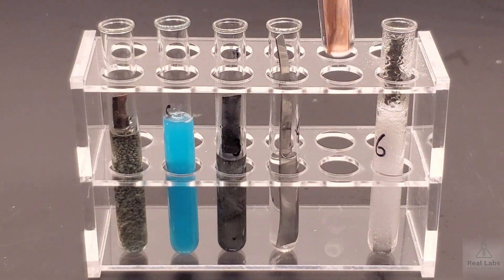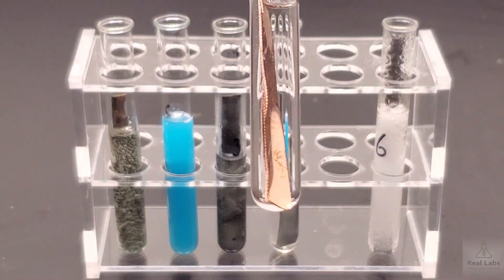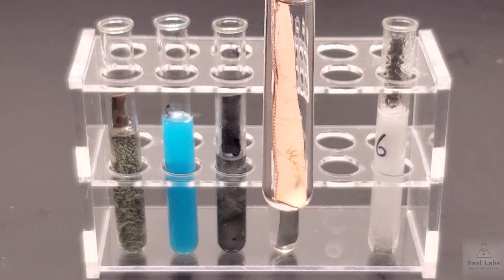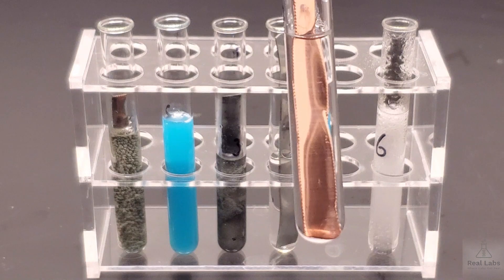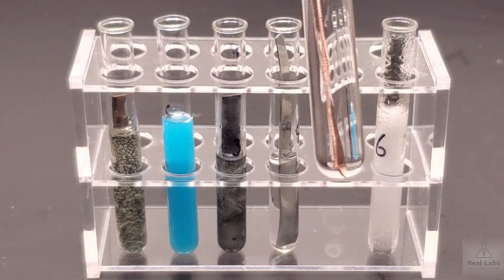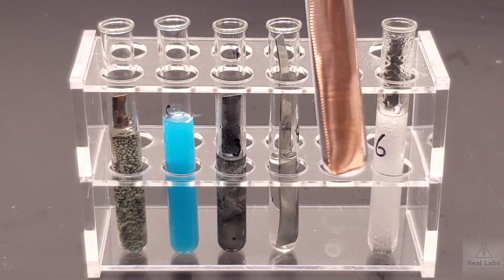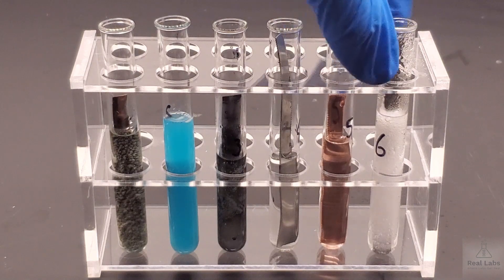In system number five, where we had the copper strip and the sulfuric acid. So the 3M sulfuric acid and the copper strip. Again, describe the metal. Describe if you see any solids. The color and the clarity of the supernatant liquid.